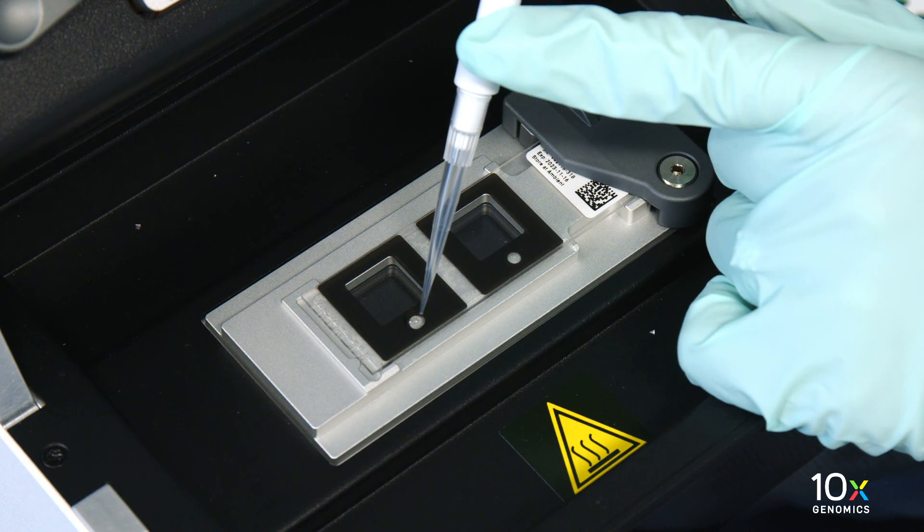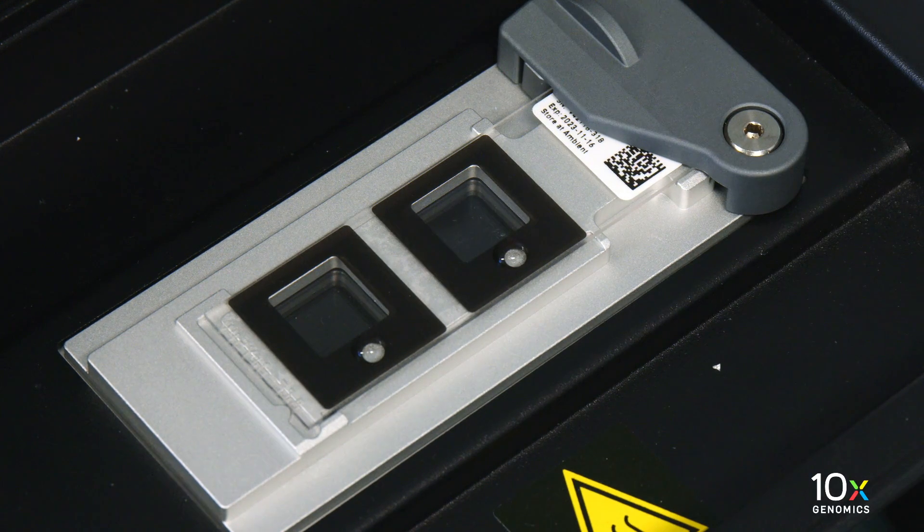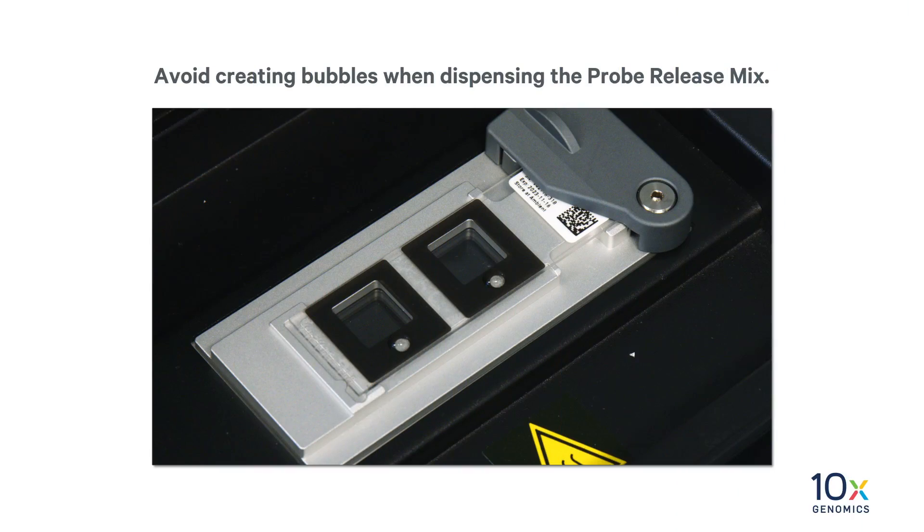Dispense 25 microliters of probe release mix into each spacer on the Visium slide assist spatial gene expression slide. Avoid creating bubbles when dispensing the probe release mix.